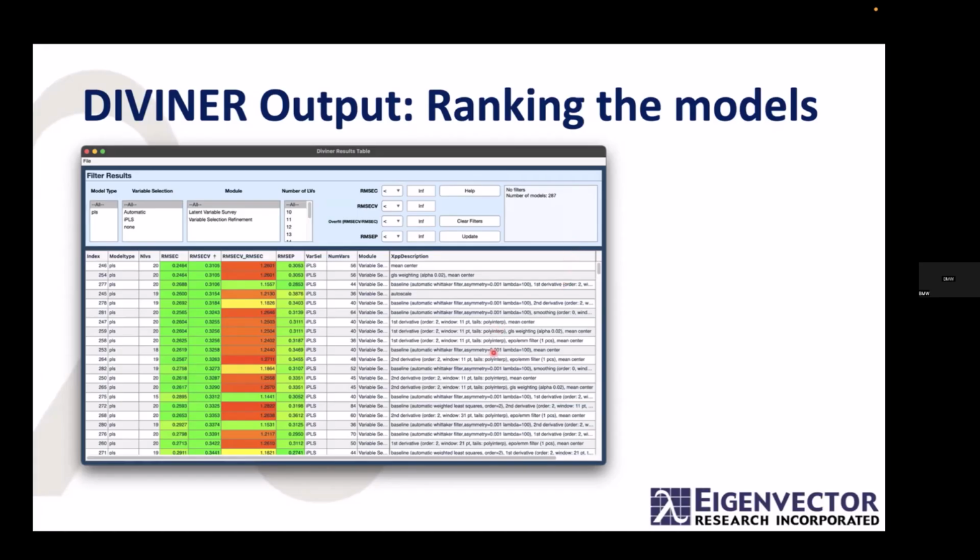You have a chance to look at them all together and get an idea of what's typical about the ones that are working best. This table is one of my favorite features when I'm in the modeling process. You can also use various filters in it to not look at certain model types, to winnow down your selections.